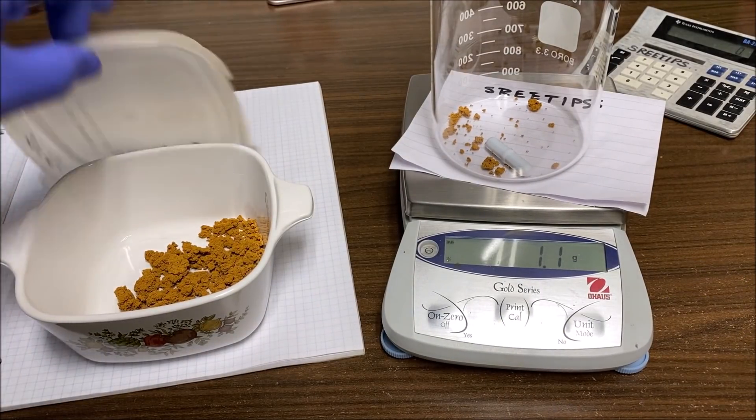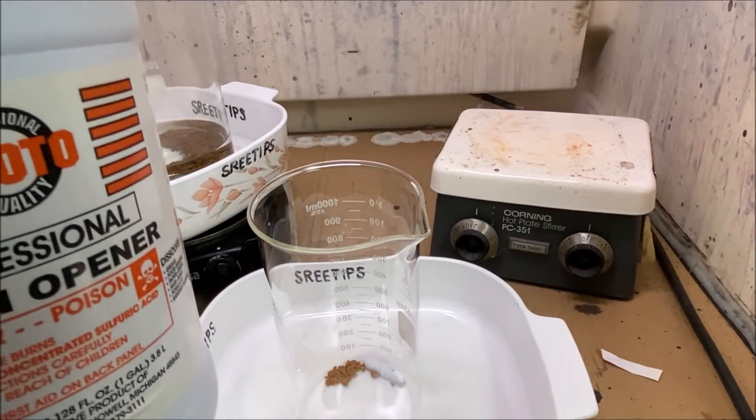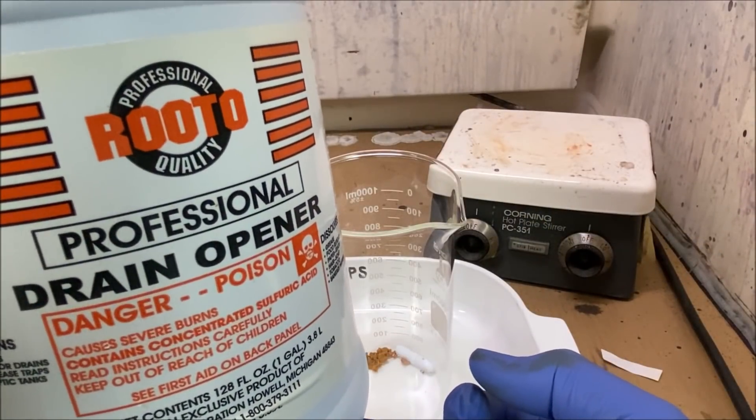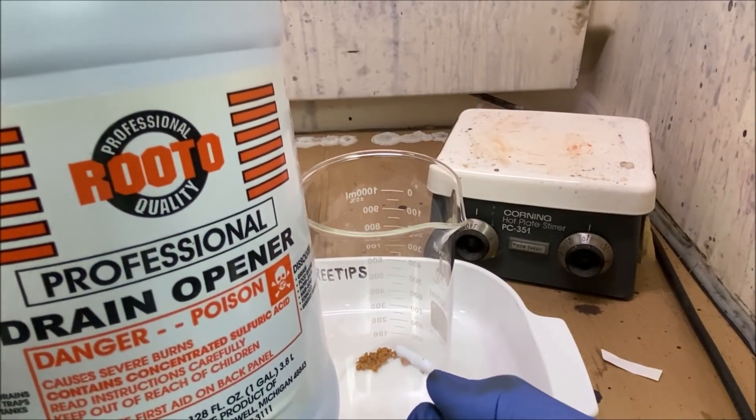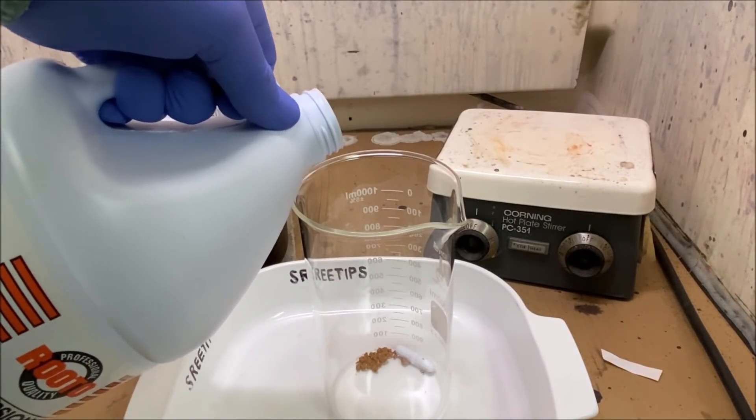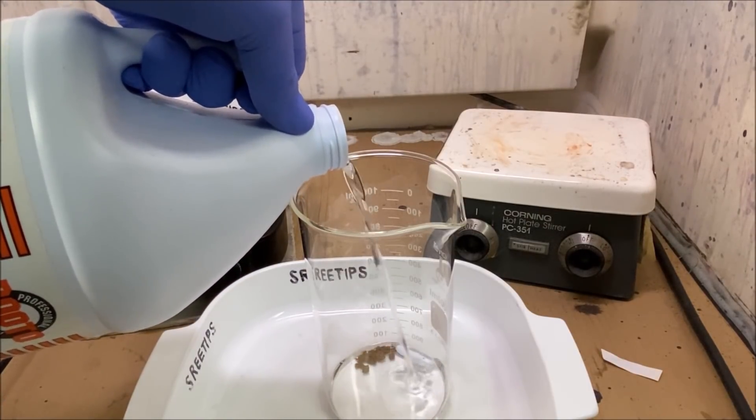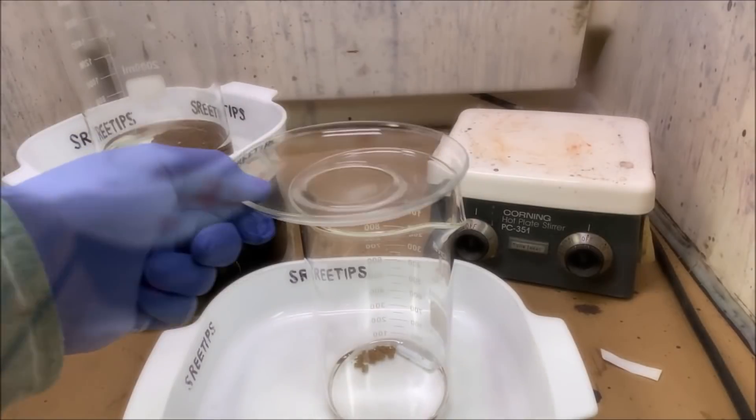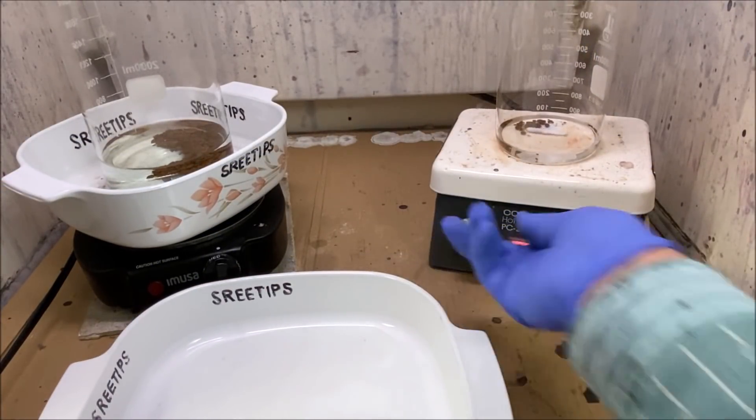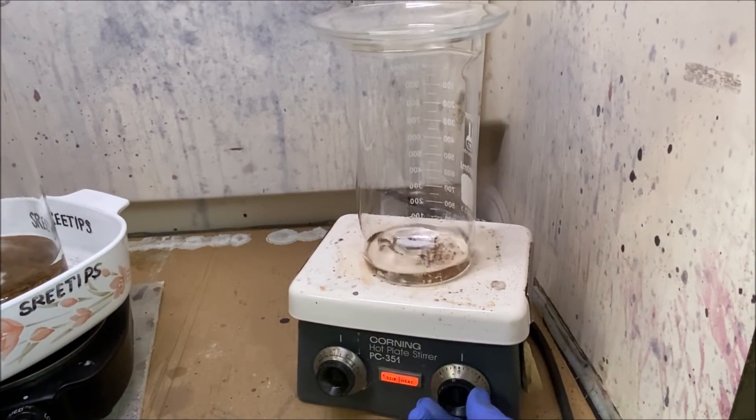1.1 grams of high purity gold for this experiment. What we'll do is add a small quantity of sulfuric acid. This is Rooto professional drain cleaner, and the MSDS says it's 93 percent concentrated sulfuric acid. I'm going to add just a small quantity here, maybe about 50 milliliters, just enough to cover the gold in the bottom of this beaker. I'm going to cover this up now, set it up here on our stir plate and turn on the stir bar. I'm adding some heat, start heating the mixture up.